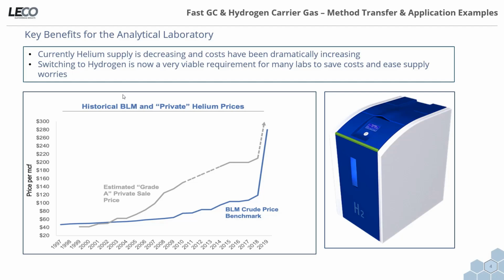And of course, hydrogen can be generated on site, and the cost of a generator maybe 5-10 years ago may have been seen as something which was quite significant, and the payback time over a few years, but nowadays the payback time is much quicker.